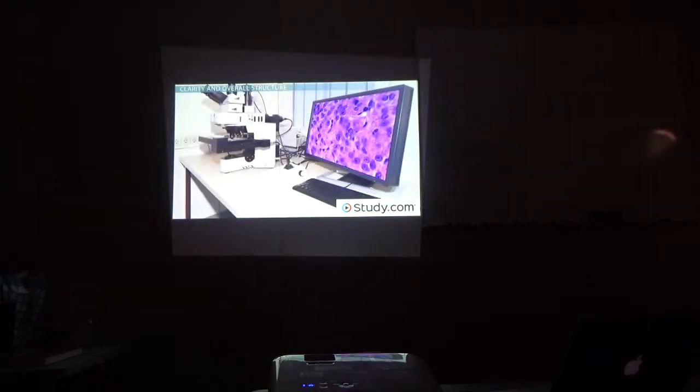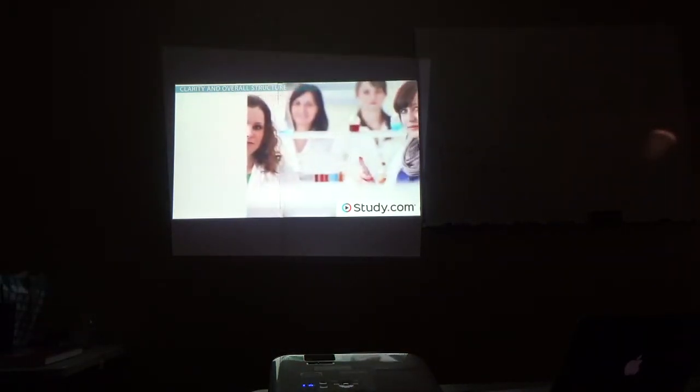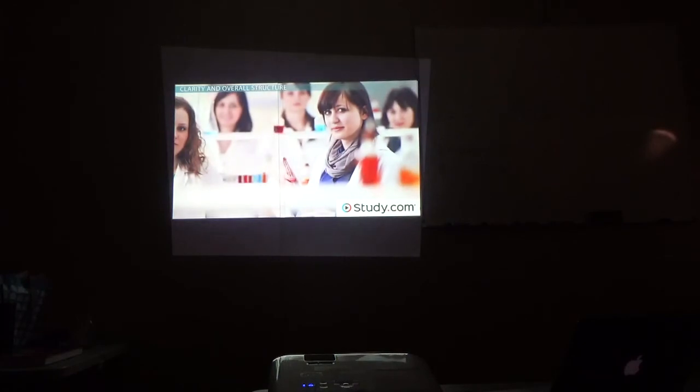No matter how large or small, a microscope is a delicate piece of equipment. It's important to use great care when using, cleaning, or moving the microscope. This will ensure that you, your lab mates, and future biology students are able to use and enjoy the microscopes for as many lab activities and experiments as possible.